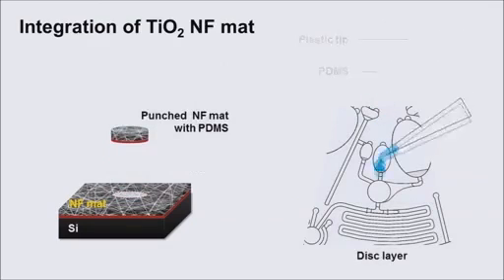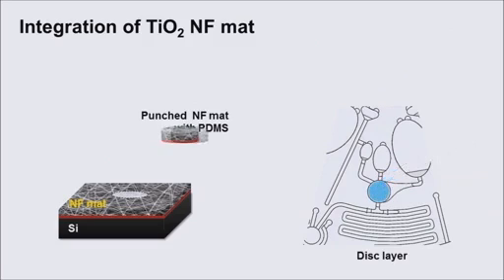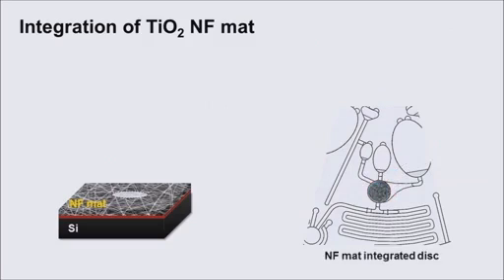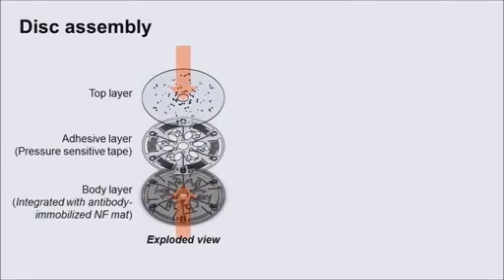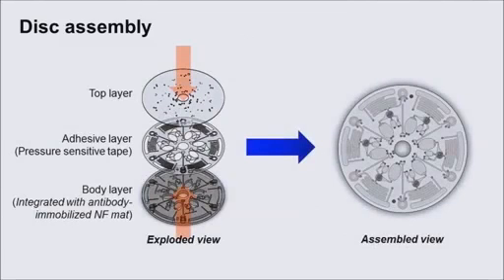Coat the reaction chamber with a drop of PDMS as an adhesive and attach the circular piece to the bottom of the chamber. Then cure the PDMS in the oven. Finally, assemble the disk layers into one complete device for ELISA.